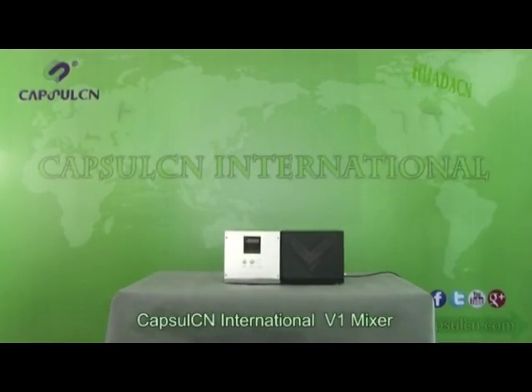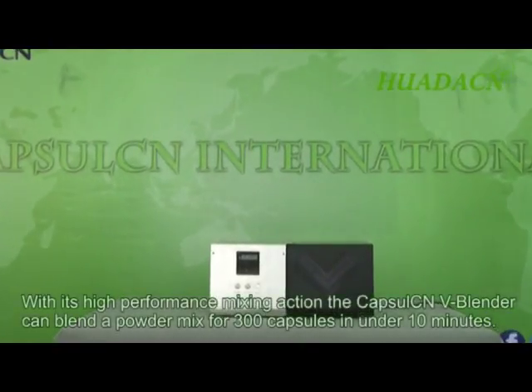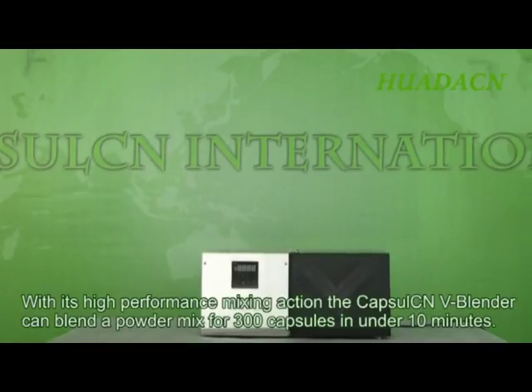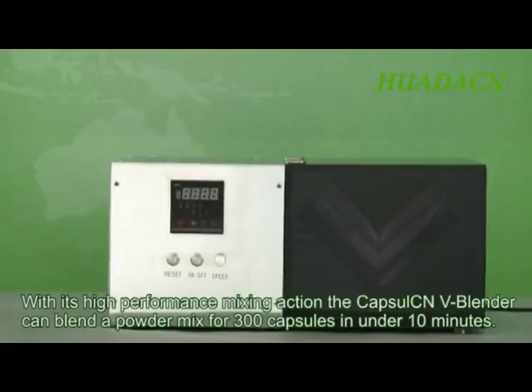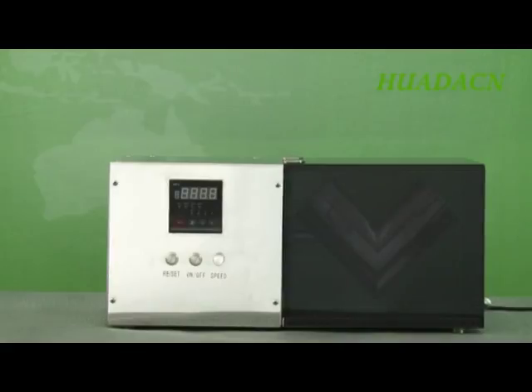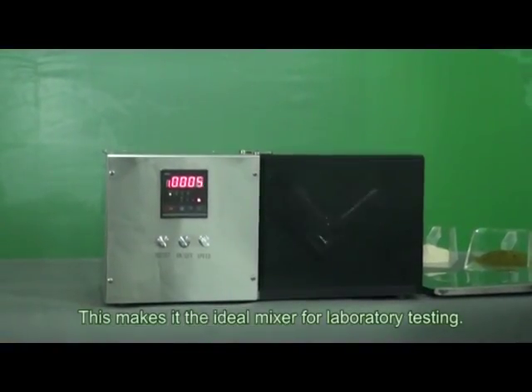CapsuleCN International V1 Mixer. With its high performance mixing action, the CapsuleCN V1 Blender can blend a powder mix for 300 capsules in under 10 minutes. This makes it the ideal mixer for laboratory testing.